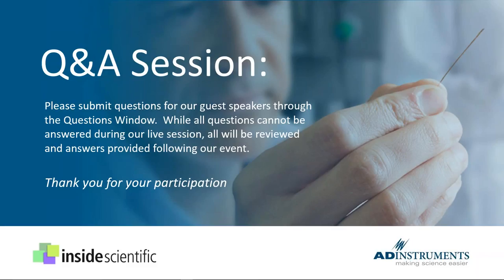Again, a very good question. We took two approaches to this. If we were going to do just a linear fit, we defined a linear portion, let's say between 80 and 100 or 110, and applied that range to all the animals. It can be challenging in heart failure mice where that range may not apply, but in most cases you typically can get a reasonable range that you can use across all animals and then fit your relationship to that.